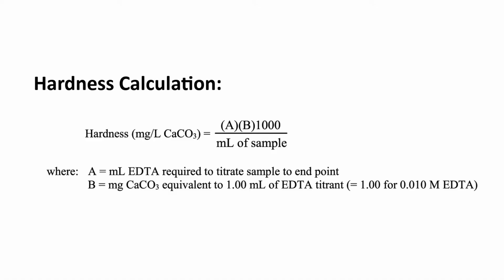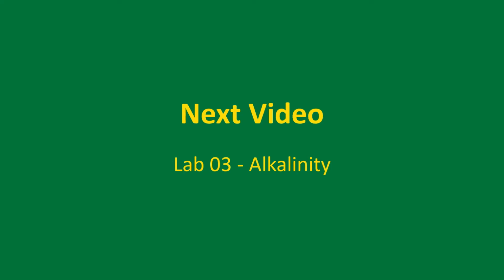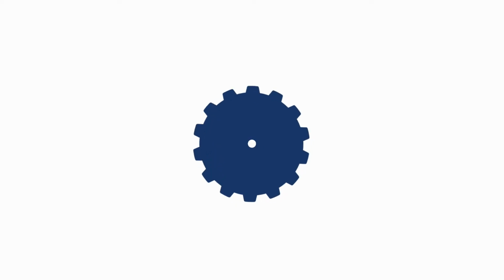For the hardness calculations, see the equation shown on screen now. In this video, we showed you how to determine the total hardness and calcium hardness in water samples. Join us next time for lab number 3. Alkalinity.